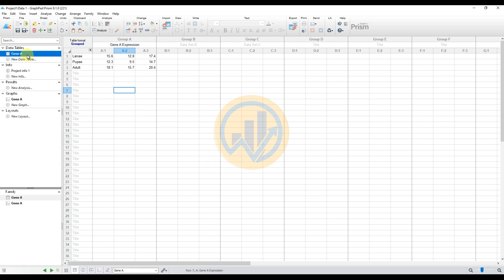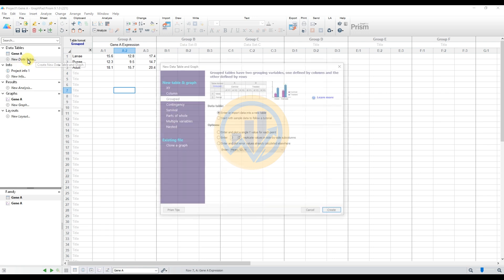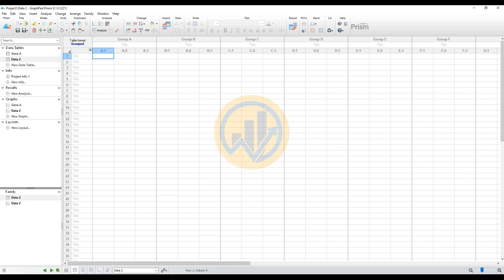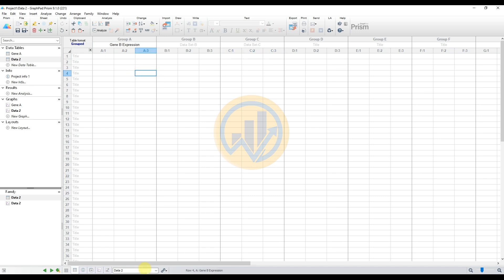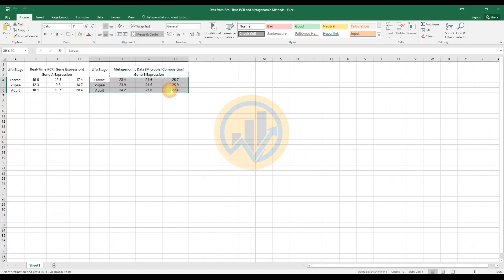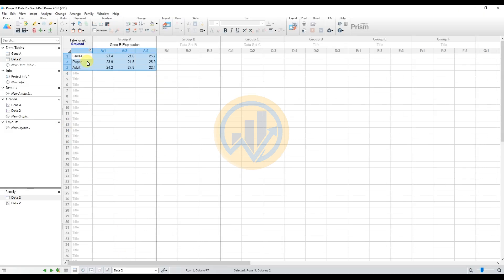Next, click the new data table button. Select the same options — group column, enter or import data into a new tab — and select three time replications. Then copy the Gene B expression data and paste it into the new sheet.